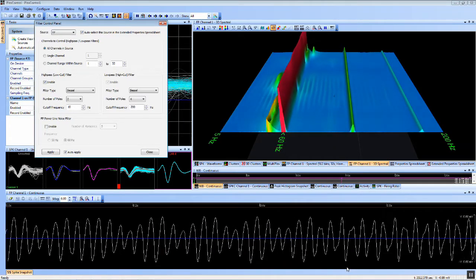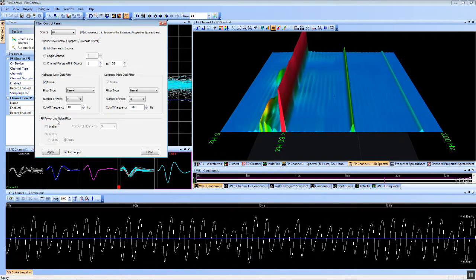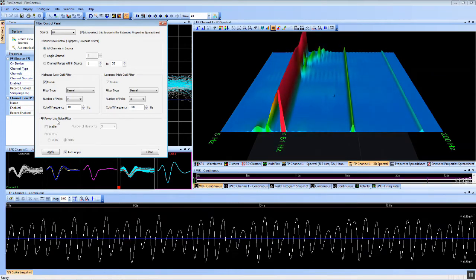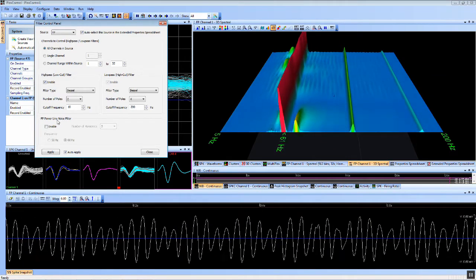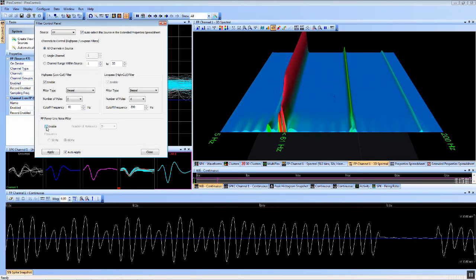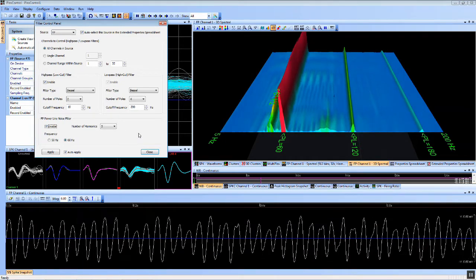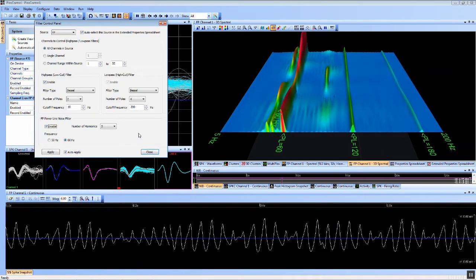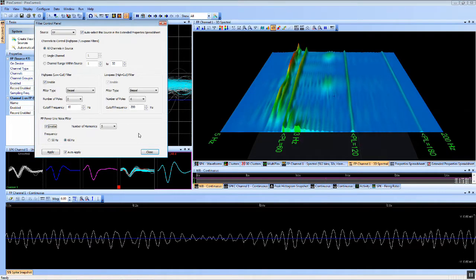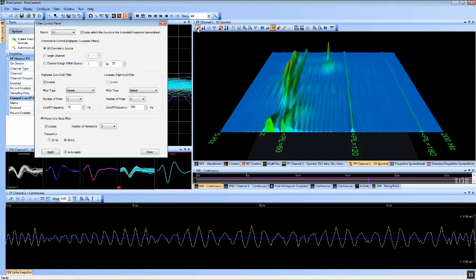Another new filter capability is the Powerline interference filter for field potentials. It's not a simple fixed frequency notch filter like the one in the OmniPlex Global filter. Powerline noise is almost never a pure sine wave at exactly 50 or 60 Hz. So, instead of using a notch, the new filter adaptively follows the frequency and phase of up to 5 harmonic components of the Powerline noise, and cancels them out in real time, without disturbing nearby frequencies or causing artifacts, such as phase shifts or ringing.